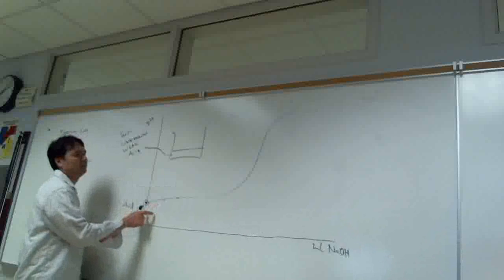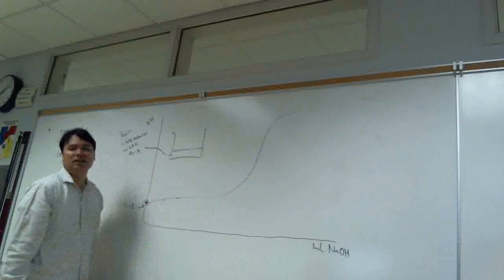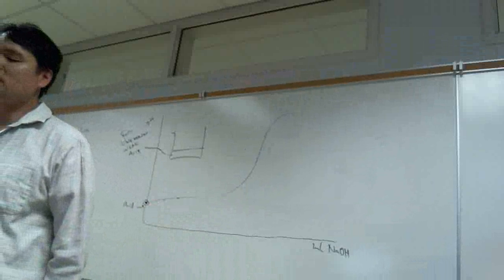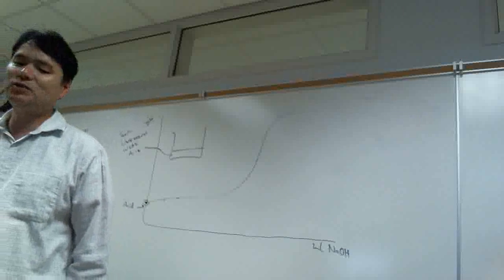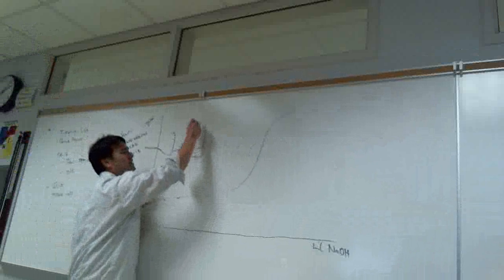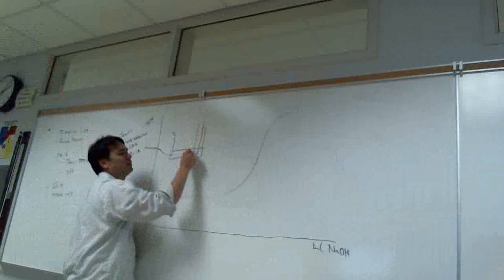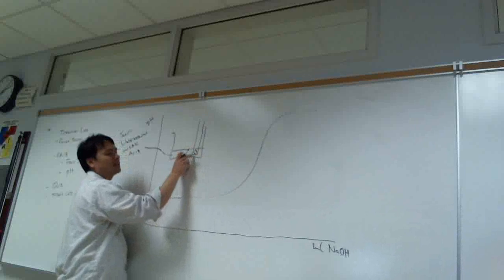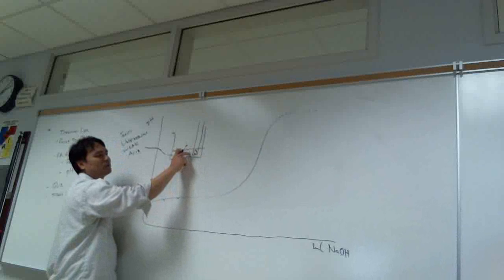there could be a problem if you dissolve it in a minimum. This is a pH titration, and we have a pH probe that we need to stick in the acid, like this. And the pH probe is going to have a little glass bulb at the bottom. And this glass bulb has to be completely submerged.